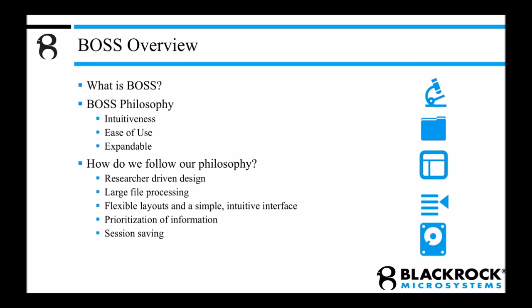Now, how do we follow our philosophy? We took in a lot of feedback from many of you on how best we can come up with a very intuitive and easy to use package. The software has gone through many iterations to be intuitive, and we're not planning on stopping here. So if you have any ideas, please do let us know.